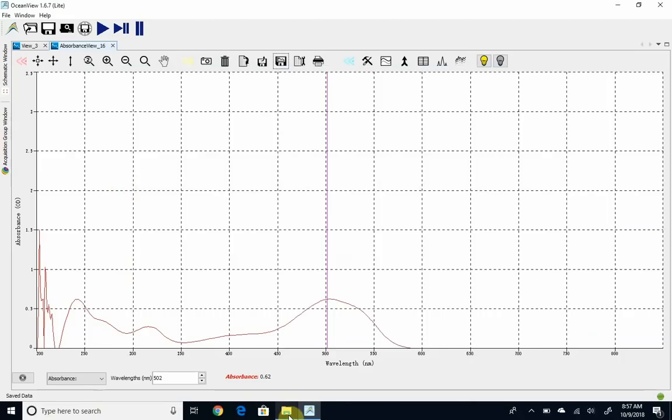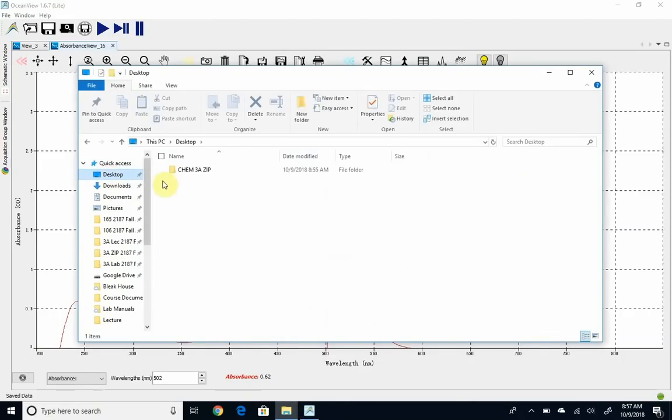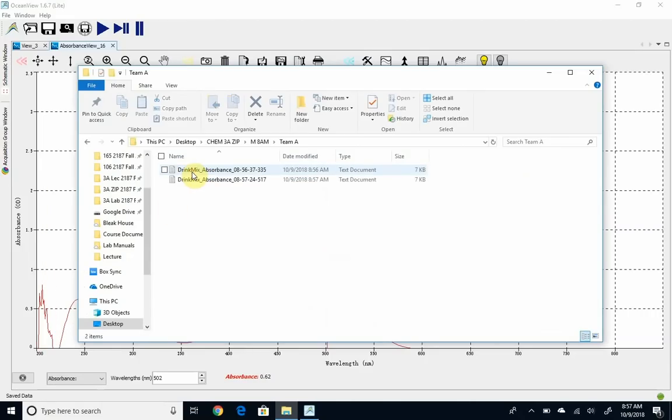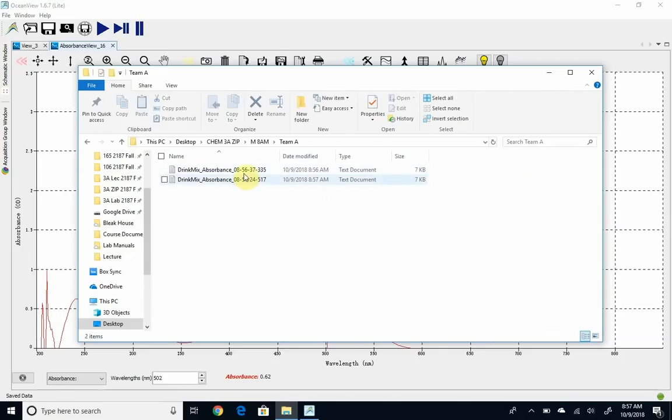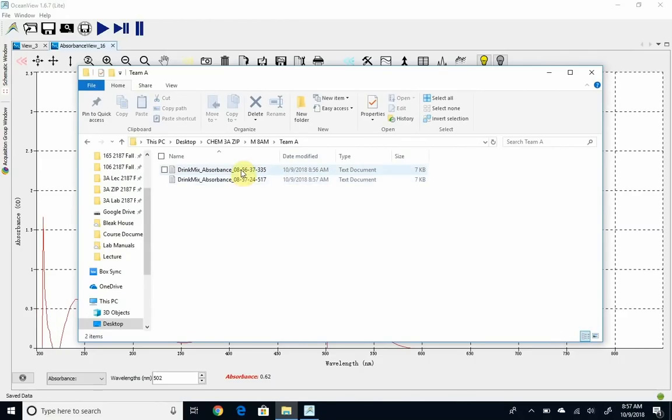So I'll go here and just show you. We went to the desktop, we created Chem 3A zip, Monday 8 a.m. In here, I have two files. You'll notice one is a little earlier, one's a little later. This is the blank, and this was my colored sample.